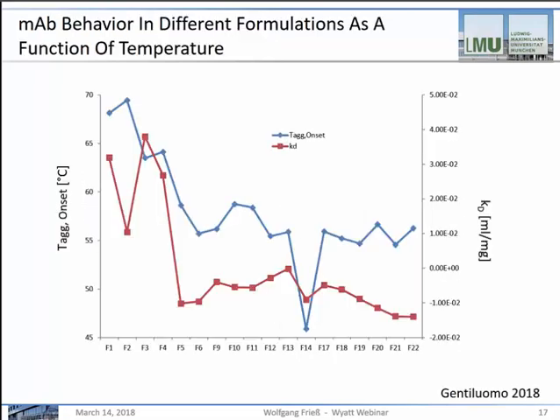As said, the plate reader is very helpful in supporting temperature-dependent studies. A typical simple outcome you can see here. The red line shows you the KD, so that's measured at room temperature.